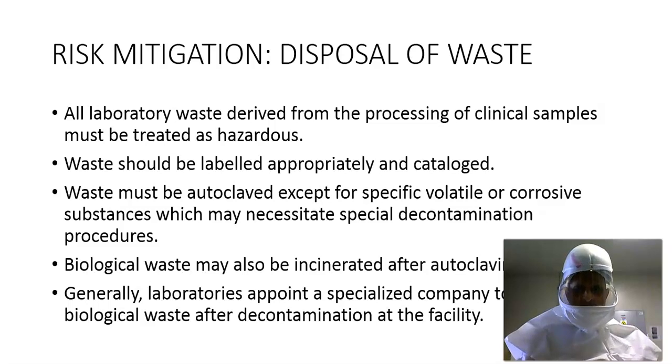One of the key aspects of sample management involves the processing of waste after the sample has been analyzed. All laboratory waste derived from the process of clinical samples must be treated as hazardous. Waste should be labeled appropriately and catalogued. Waste must be autoclaved except for specific volatile or corrosive substances which may necessitate special decontamination procedures. Biological waste may also be incinerated after autoclaving. Generally, laboratories appoint a specialized company to manage biological waste after decontamination at the facility.